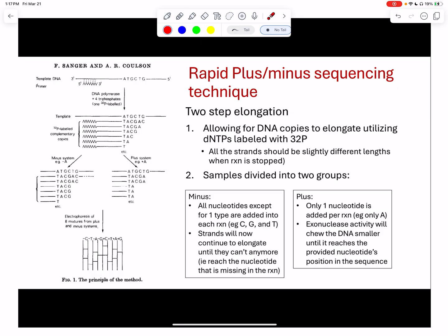What that basically means is that we take some genetic material, we put it in a test tube, we have some sort of reaction, and then we take that material, put it in another test tube, and have a second reaction. Those two reactions are what ultimately help us figure out the sequence of this genetic material. The first step is highlighted in this first half of this image here.